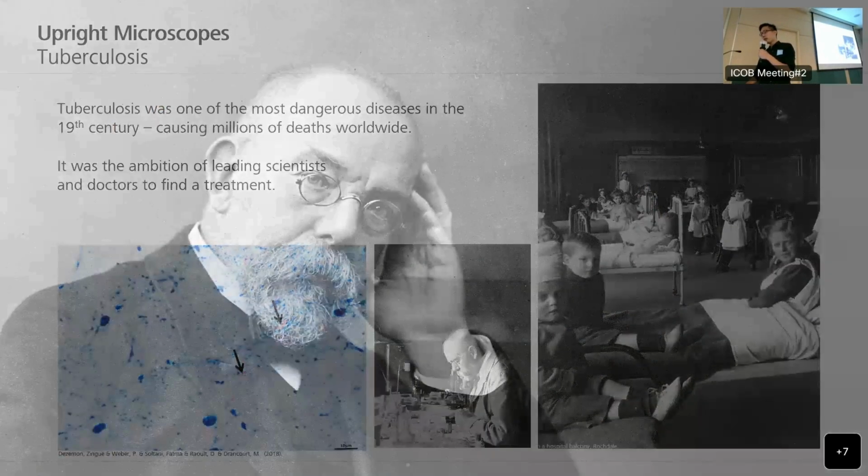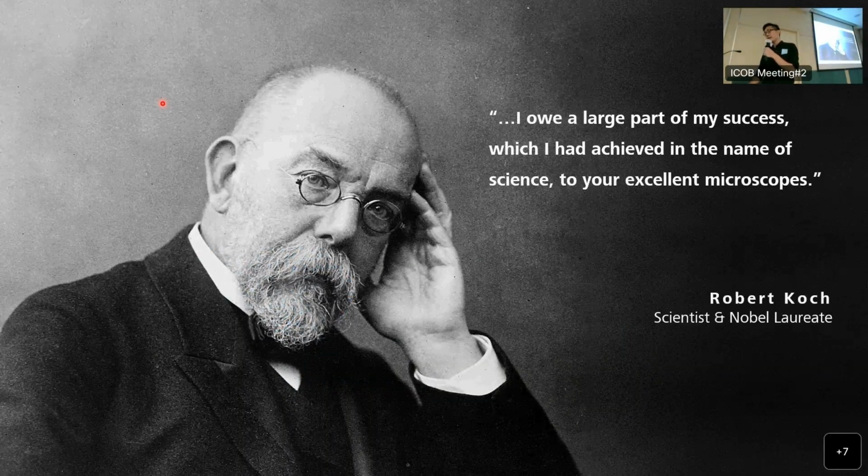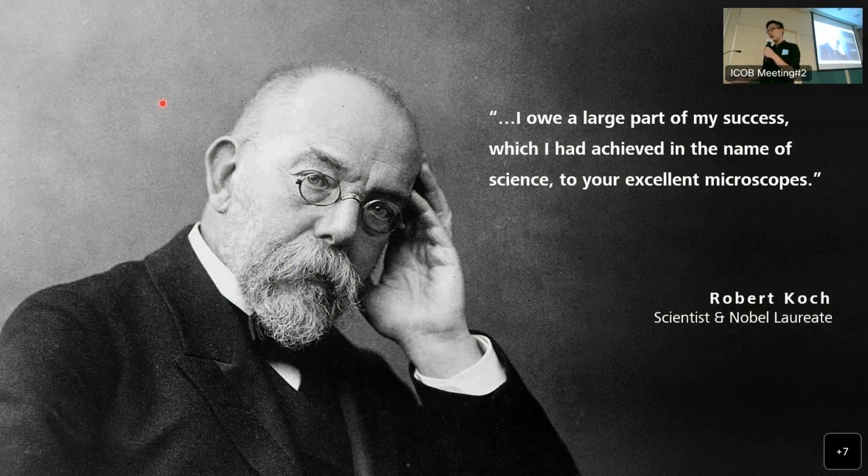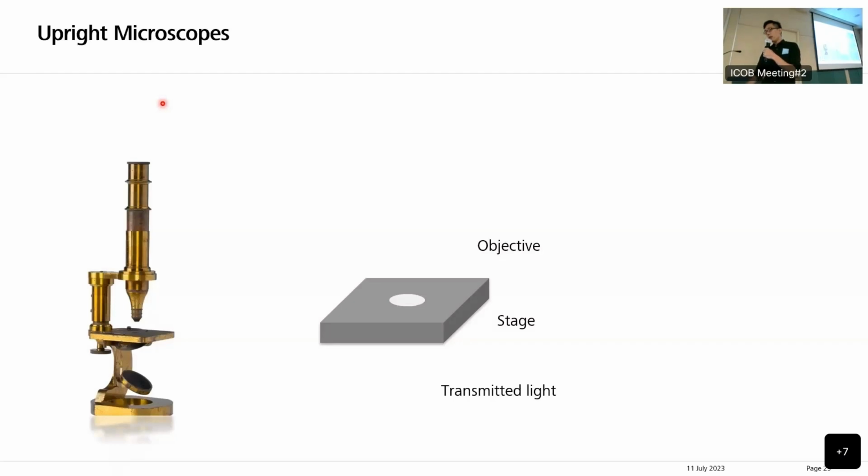And so Robert Koch actually thanks Carl Zeiss for providing the excellent light microscope, so he could solve the problems. And here we can see an antique type of light microscope.